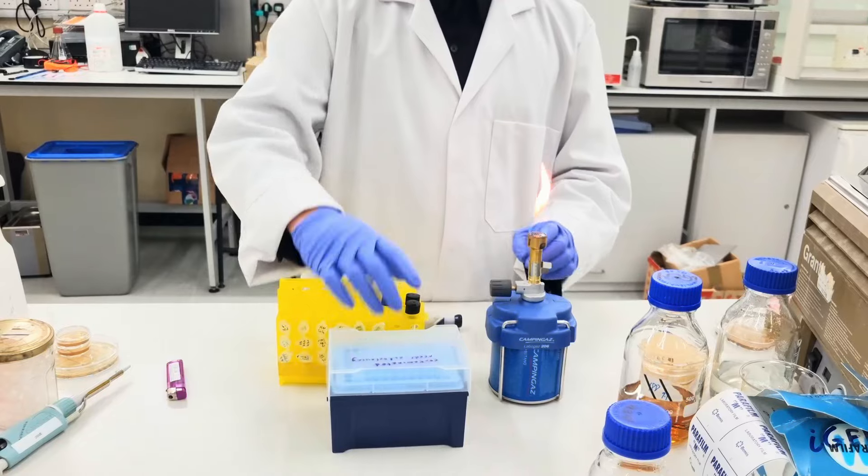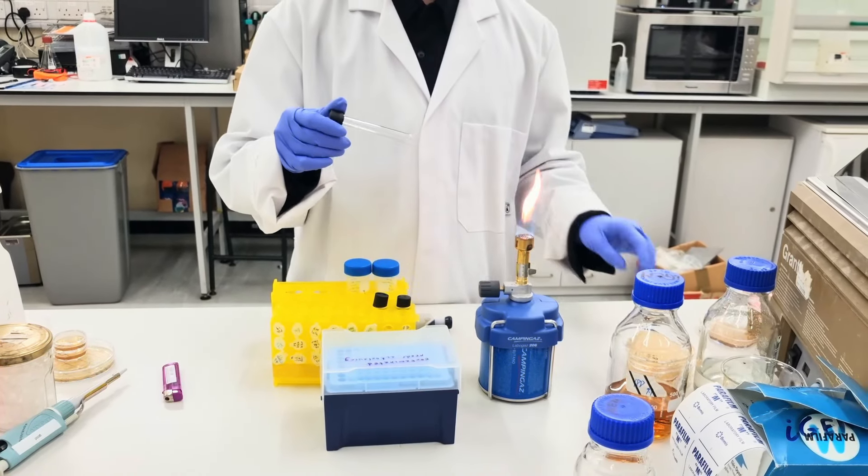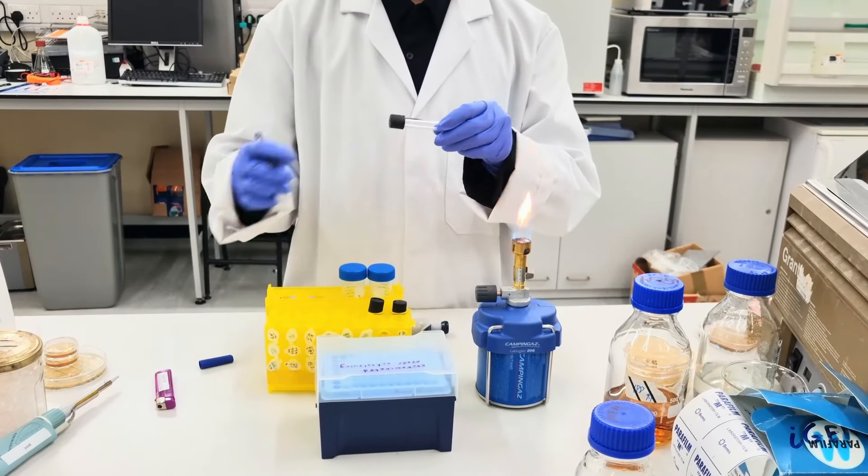And now the next step is to get a fresh culture tube and label them with the names of the strains or dates you want to use.